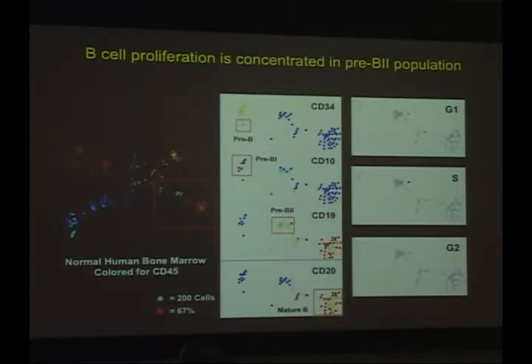From work like Sean and Aaron's work using phosphoflow from the Science paper, it also helps us know, here are cells that signal clearly like this population, and then I can go back and say, well, what were the immunophenotypes of those cells? And then I can use that information to help me make my gates. So it's a combination of all of those things that have helped us derive this. But the Science paper is a great reference.